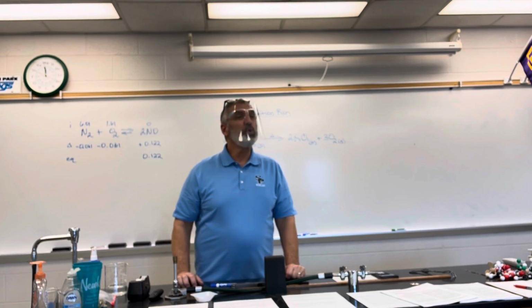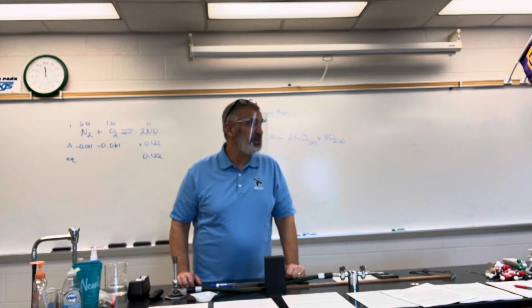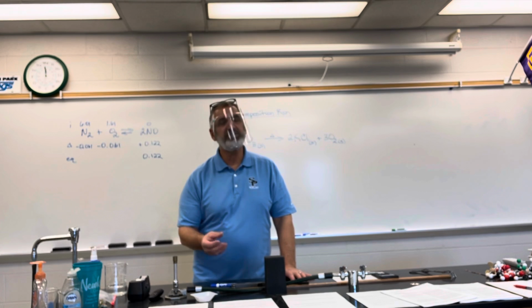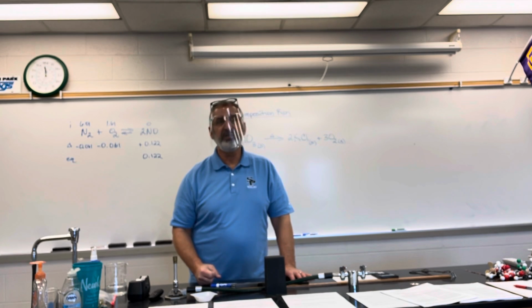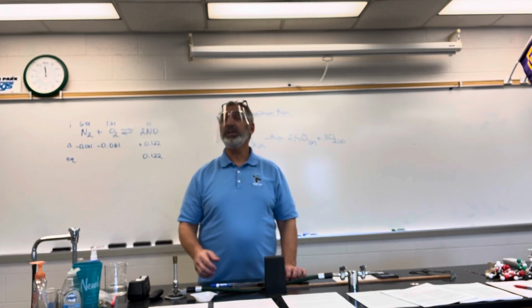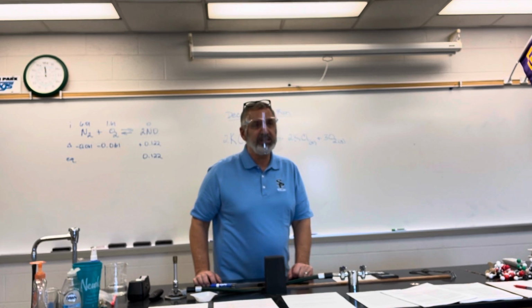It actually gives you a slightly wrong answer. So we're going to let it cool for 2 to 3 minutes. It doesn't have to be cool to touch, but it doesn't need to be piping hot either. You still don't want to touch it with your fingers because you'll burn yourself pretty severely, and we don't want that. So we're going to have crucible tongs, and I'll show you what those are and how to use them when we get into the lab.